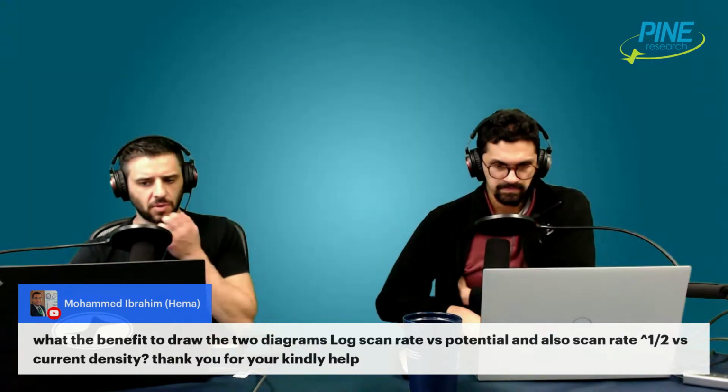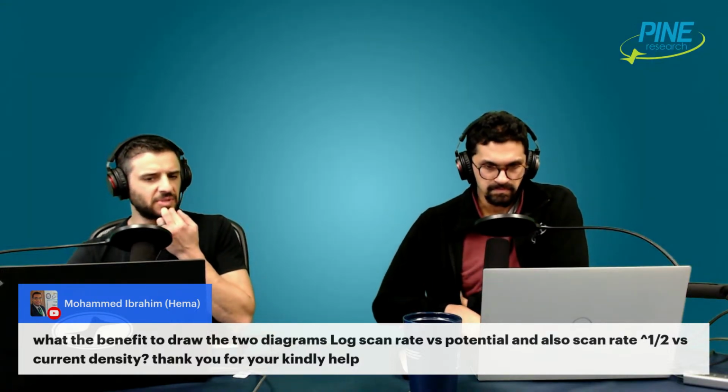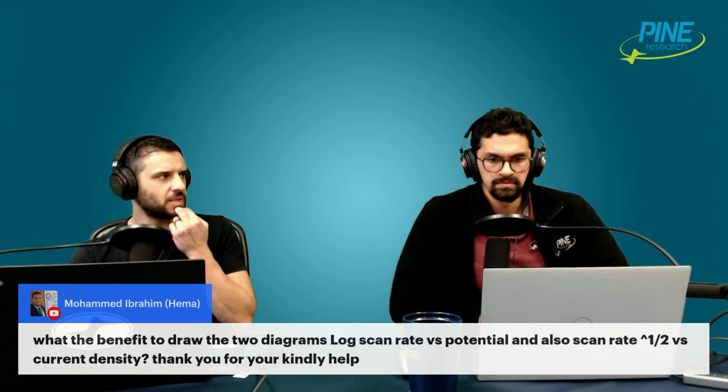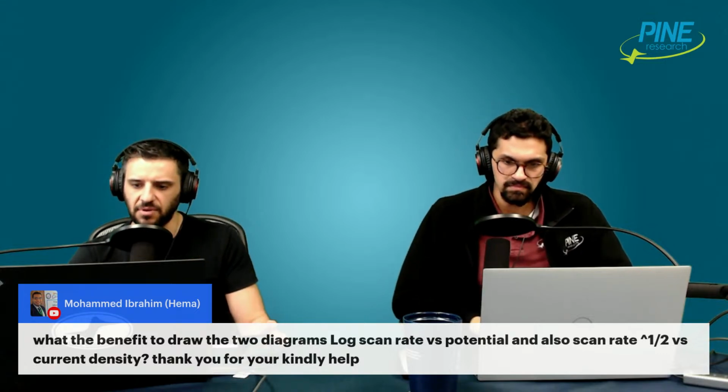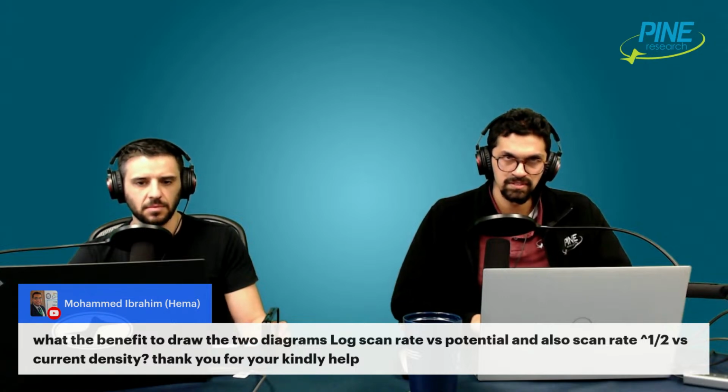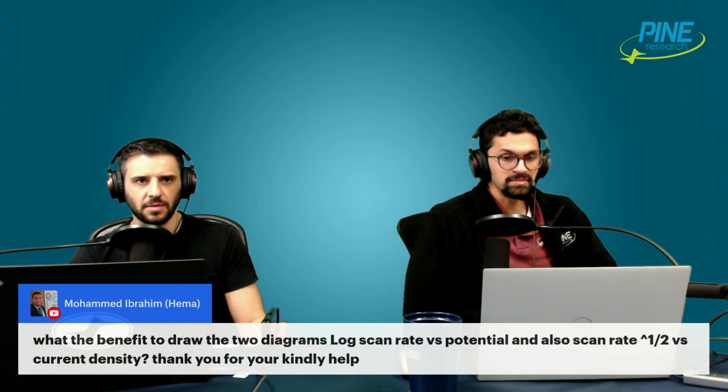So first of all, I'm not sure what log of scan rate versus potential is for. What am I missing? I can't think of it. Unless he's talking about the trumpet plot, and instead of plotting it versus the scan rate, you plot it as the log of the scan rate. Yeah, that's maybe the only one I can think of.